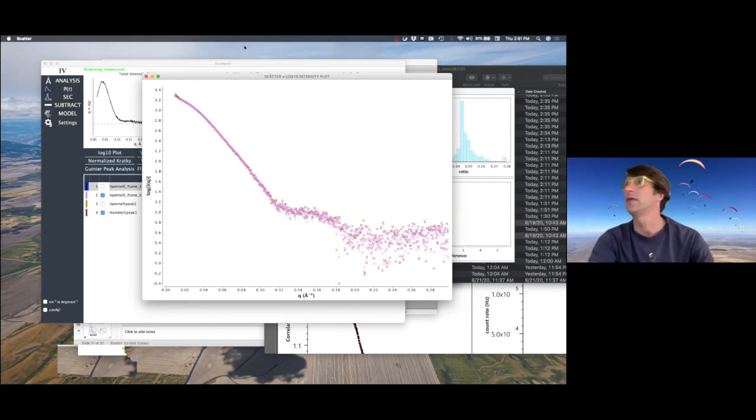But it's still big compared to the 20 micrometers at APS that Jesse mentioned, 20 to 4 micrometers with probably the same flux. So I would say the problem with aggregation at those beamlines for biomaterials needs to be addressed and solved.